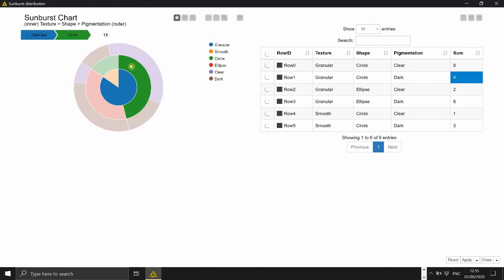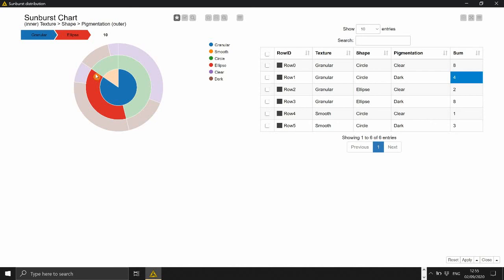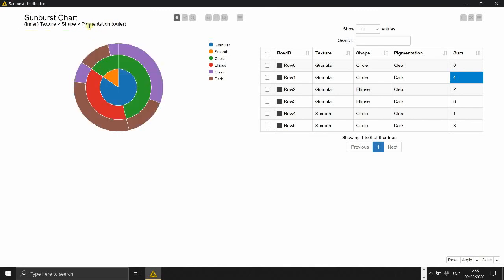Then the second circle, second level of feature is about the shape of the embryos which can be either elliptical or circular. And finally the outer level is the pigmentation.